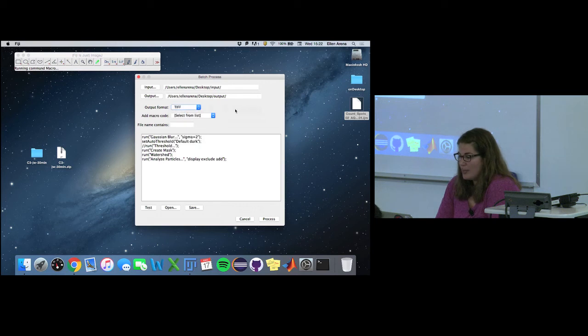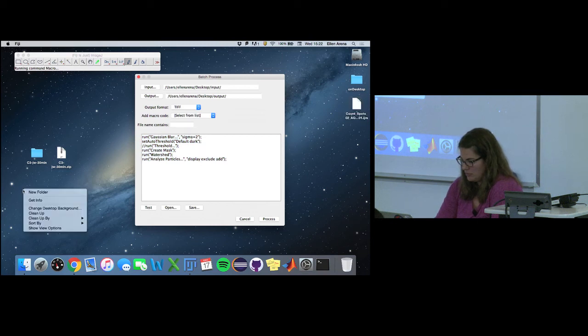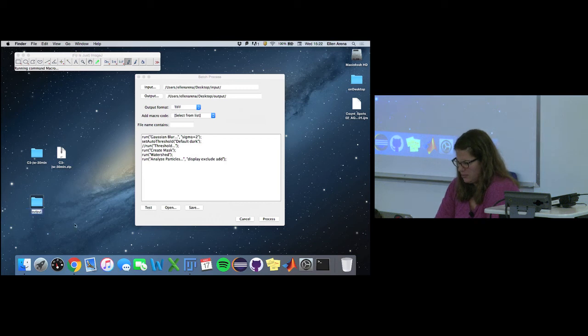And then you can just copy and paste your code right in. Here, this is just the default that I had. That's pretty much what we did before, right? Gaussian, then we applied a threshold to image, mask, watershed, analyze particles. So actually, I could run this just quickly for you. And process. Oh, I have to do that again.